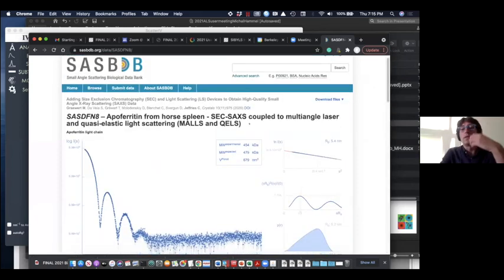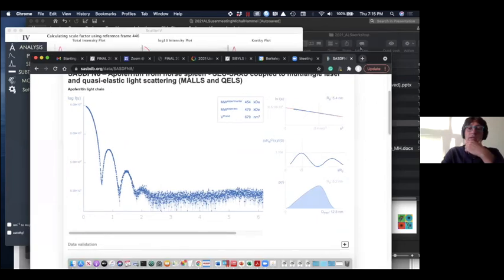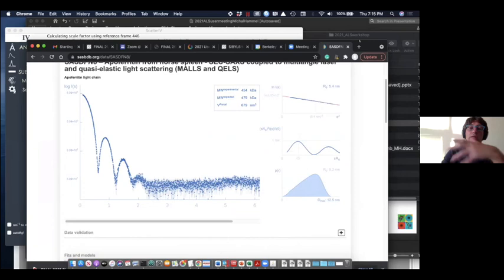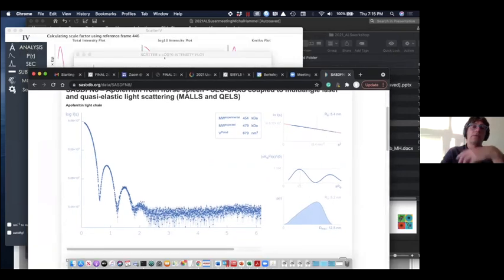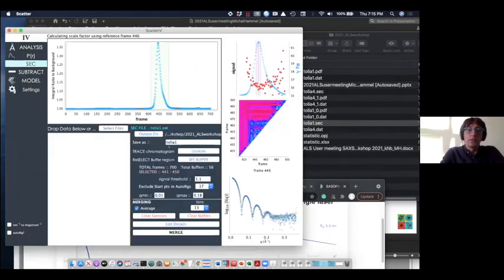And you can upload this data and compare it with your data sets. So just be sure that what we're delivering is about 400, 500 kilodalton. Perfect. So this is your data, this is your raw function. So you can get this information from here and you can compare what you got. Let's just compare your apoferritin with most likely some small antibody on it. I'm just guessing 20 kilodalton, that's it. But I was just guessing.